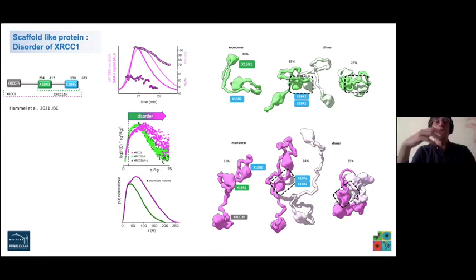They're moving those N-termini, central domains and C-terminal domains in a very dynamic fashion. It's similar when you cut one of the domains: it still stays a monomer-dimer mixture with very unfolded regions. So that is how we can recognize this unfolding through the Kratky plot.